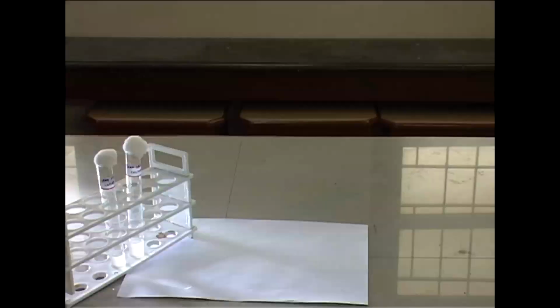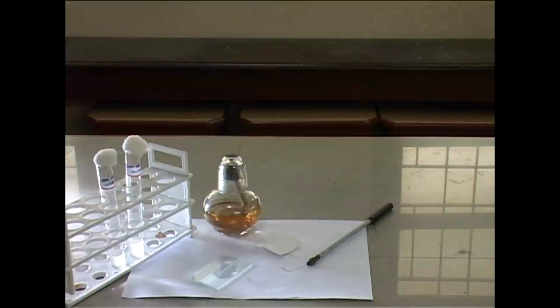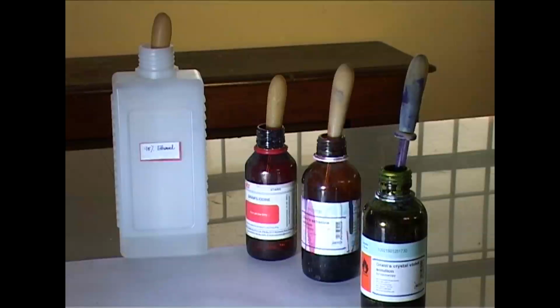We require one gram-positive culture and one gram-negative culture, in this case Escherichia coli and Staphylococcus aureus. We require clean, grease-free slides, an inoculating loop, a spirit lamp, blotting paper to remove the excess water, and a microscope. Reagents required: crystal violet, Gram's iodine, 95% ethanol, and safranin.